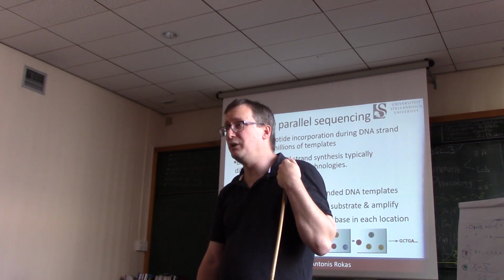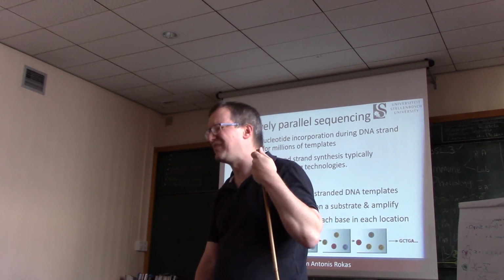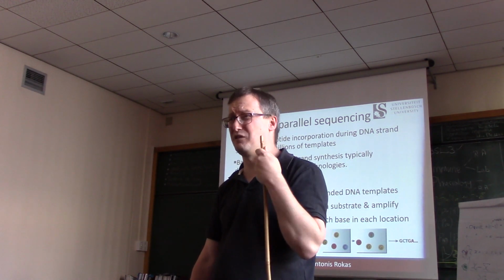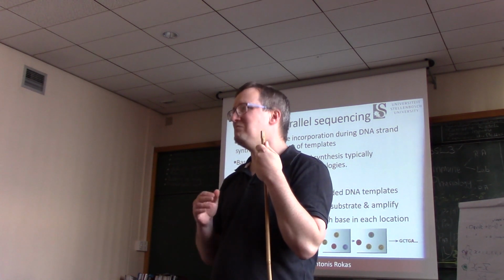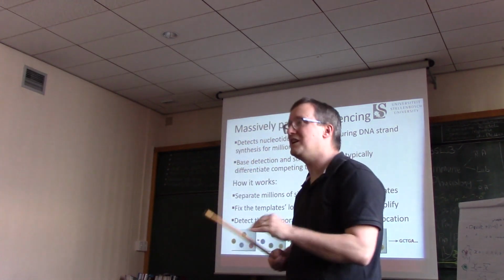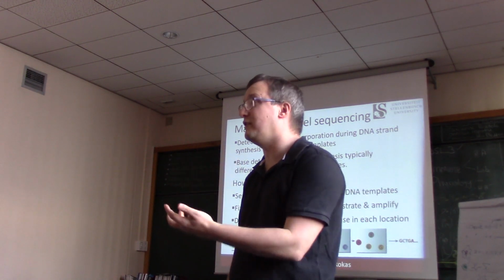Most generally, we are using what a lot of people call next-generation sequencing. I hate that term. The reason why is that next-gen sequencing has been a thing for more than 15 years, and the first next-generation sequencers would seem positively primitive today. So I really prefer the term massively parallel sequencing because it describes more accurately what these instruments are doing. And the clue is right there in the name.